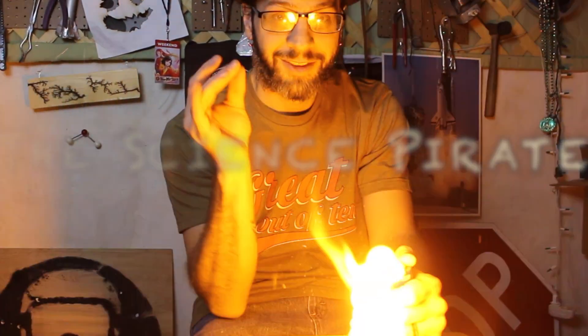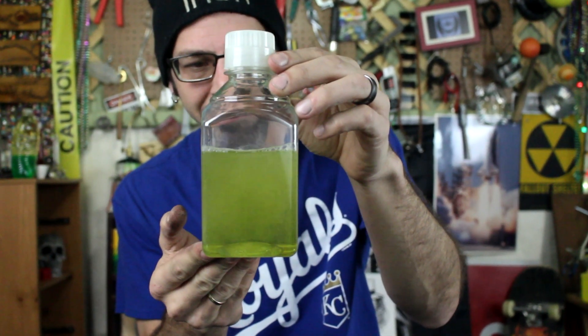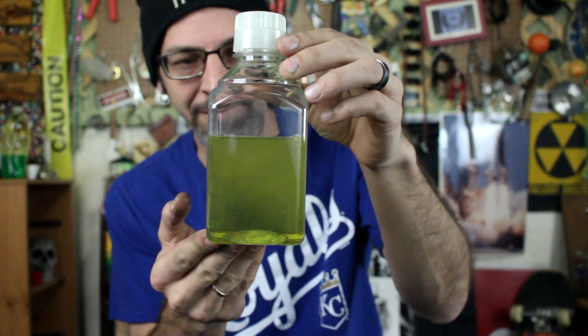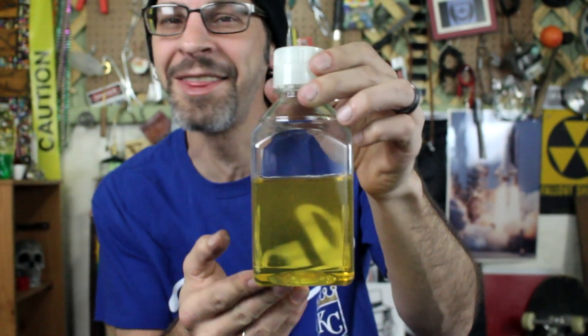Today we're going to make a really interesting solution — one that actually changes colors when you shake it. This is a pretty interesting solution. Look at that red!